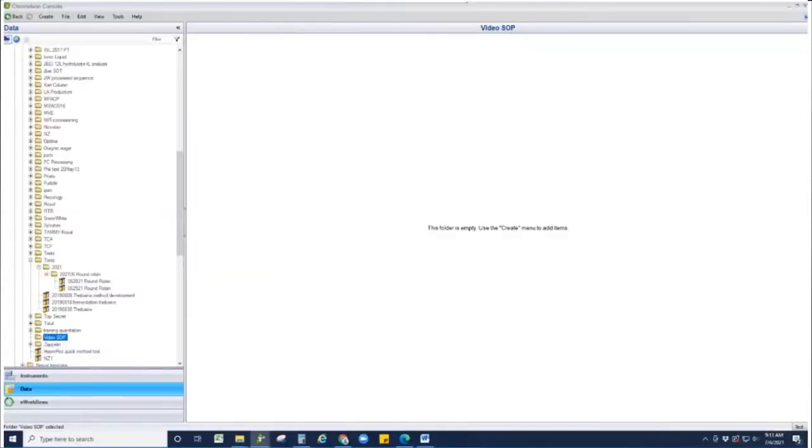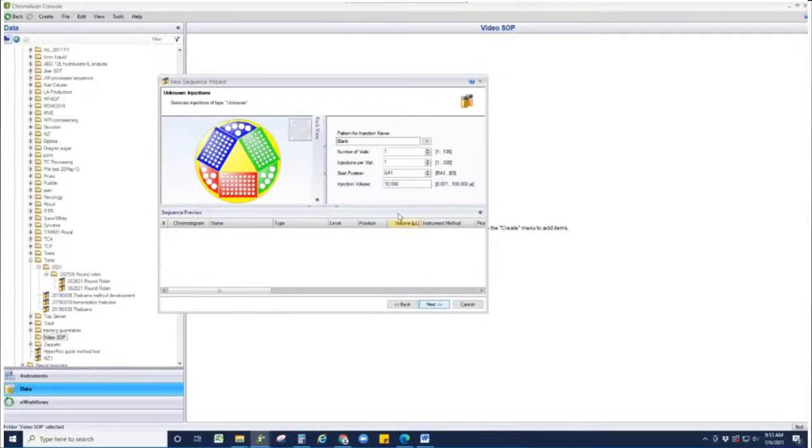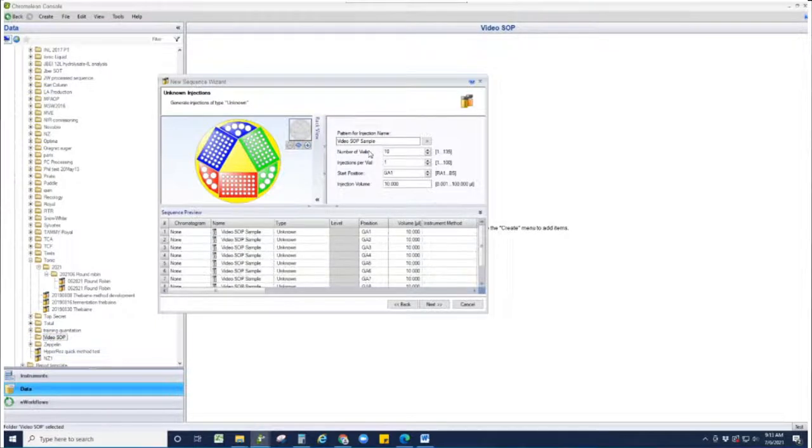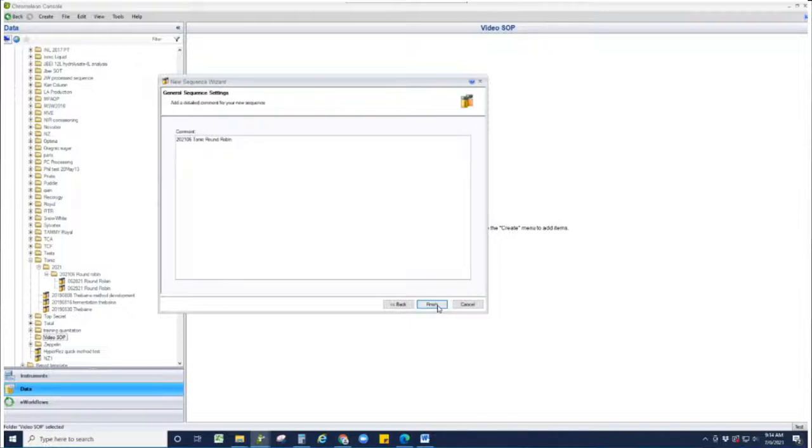To create a sequence, begin by navigating to the Create tab and selecting Sequence. The new sequence wizard will appear and you will be prompted to select the instrument. Select UHPLC Ultimate 3000 and hit Next. Now you can build your sequence to reflect the number and type of samples which will be run. If you are using a known instrument or data processing method, you can browse and load these as well. Once you have created your sequence, be sure to save it to the proper folder and consistently save it as you make changes and add injections.